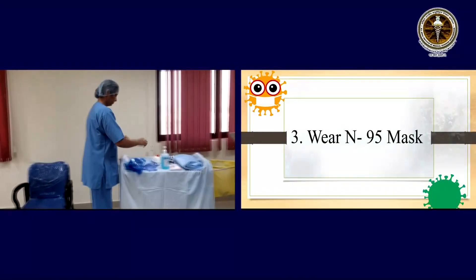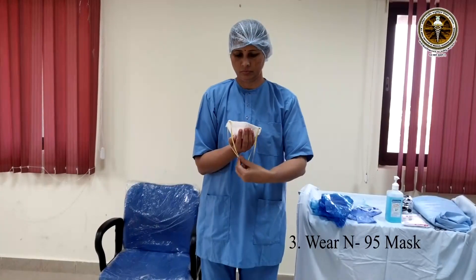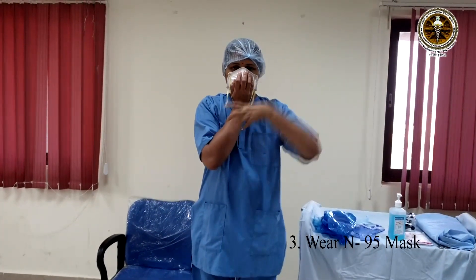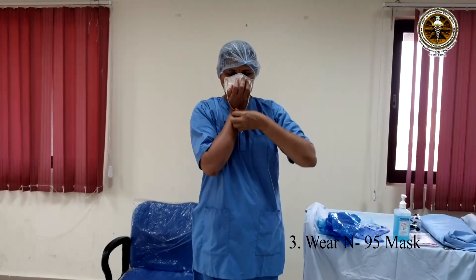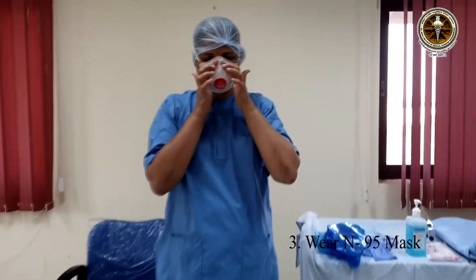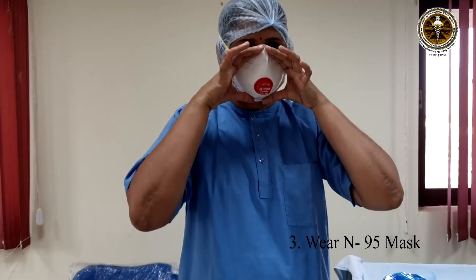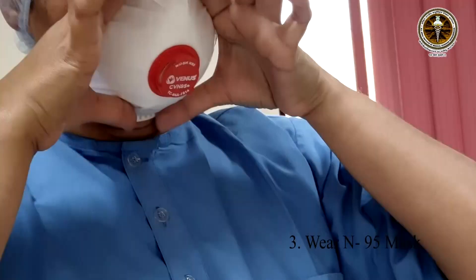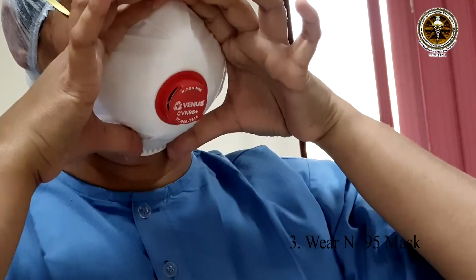Wear the N95 mask. We are wearing the mask first here as we are near the COVID unit, and this would prevent or minimize the exposure of the air to the healthcare worker. For wearing, hold the N95 mask by placing the cup of the mask in one hand such that the strings fall downward. Place the cup of the mask on your face such that the nose and mouth is covered. Pull the lower tie upward over the head and take it till the nape of the neck. The upper tie goes to the top portion of the head. Fix the flexible band on the nose bridge.